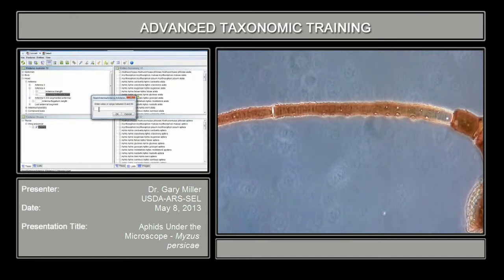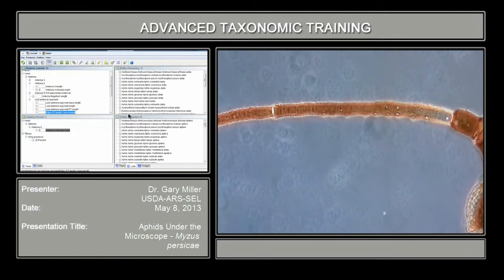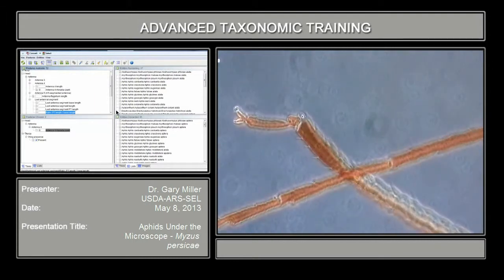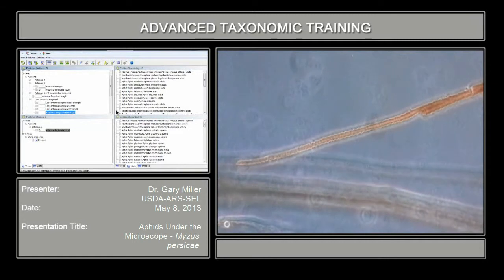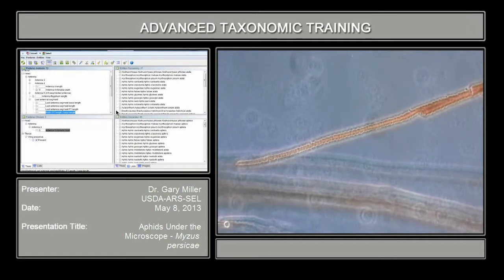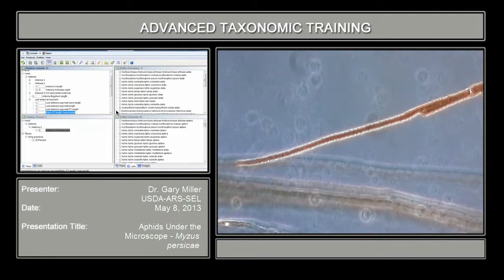So we're going to add our value of 0 and OK it. Now again, we're at the process terminalis length and base length, so we're going to make a measurement here. One of the things you want to keep in mind is that you want to make sure that the terminal process has CD on the end, because that makes it clear that that is the end of the terminal process.